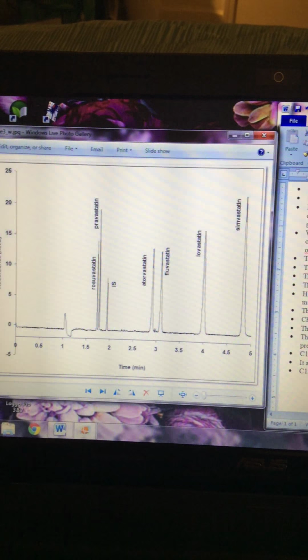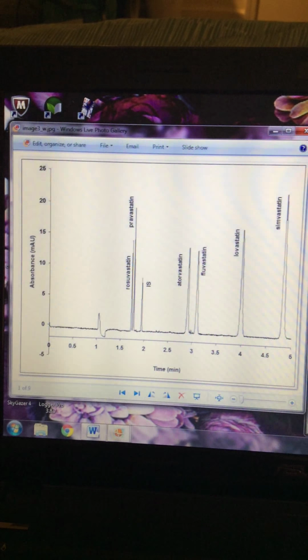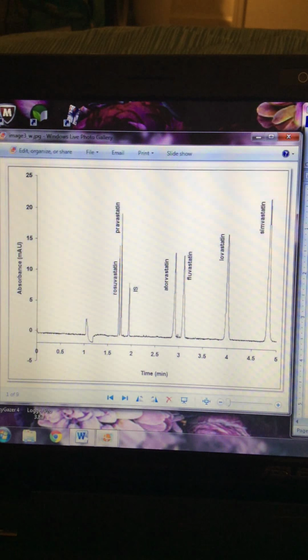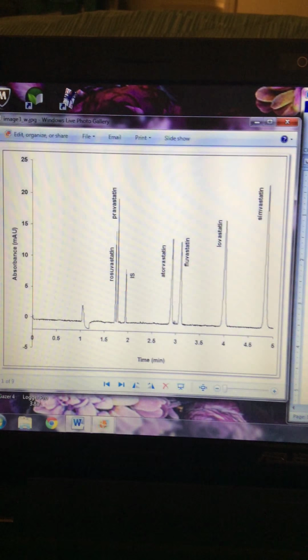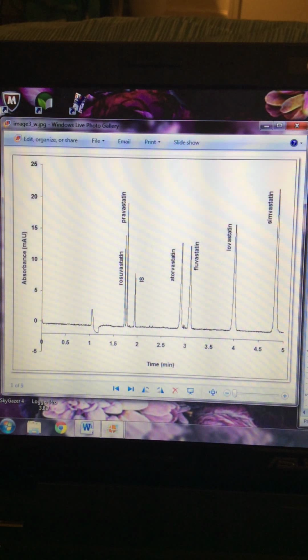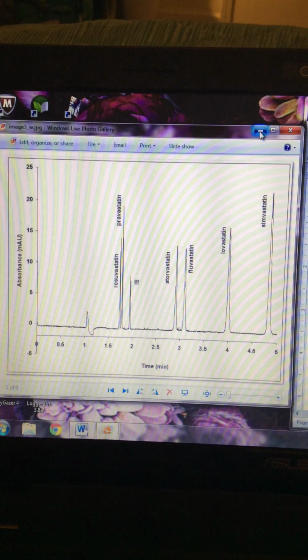And within the H1 NMR, there's something called the chemical shifts, which are the resonant frequencies of a nucleus relative to a standard. And the position and number of chemical shifts are pretty much diagnostic of the structure. And with rosuvastatin, there are downward shifts due to the de-shielding effect that comes from the presence of hydrogen bonds. So that's pretty much the rundown of what would be the H1 NMR for rosuvastatin.